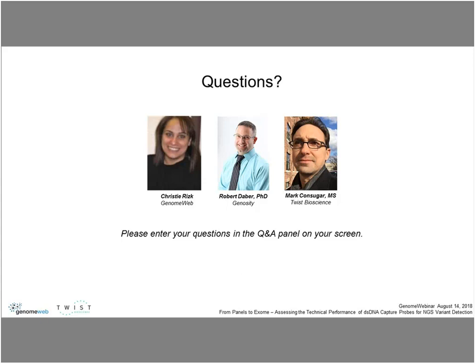Okay, great. Bob, you had some data that showed that Twist had some lower on-targets as compared to some other methods. And Mark, you might want to jump in on this. The question is, are there some modifications that can be made to the Twist exome that could improve those metrics? Yeah, of course. What we showed was an unbiased view of just running the assay without any tweaks or modifications.